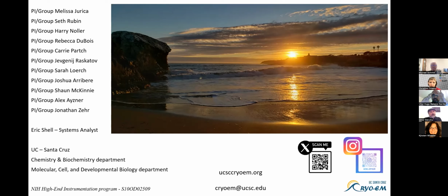It's easy to average once you have the donut, but with things that are slightly floppy like this, even though we are not seeing atomic resolution, we start seeing those, and it is a matter of disturbing your sample less. So now we are collecting way better, I would say, in terms of getting more data with lower dose. And then we were able to start seeing the parts that are supposed to be unseeable, right? It's just because they were floppy before.